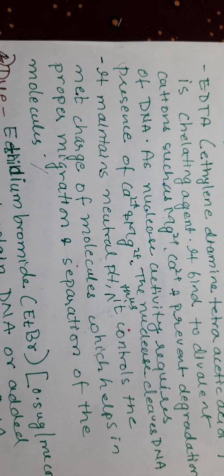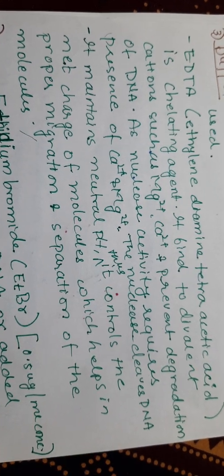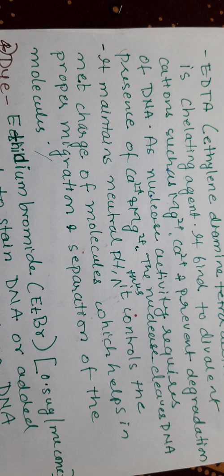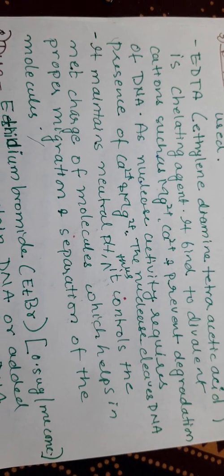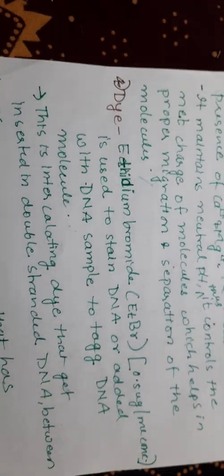Secondly, the buffer maintains the neutral pH. Thus, it controls the net charge of the molecule, and that helps in the proper migration and separation of molecules.